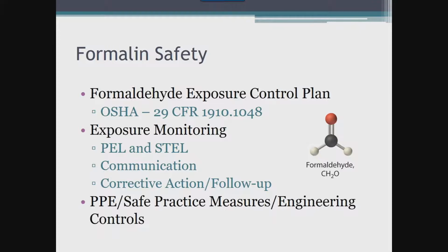Formaldehyde has very specific exposure limits. There is the permissible exposure limit and the short-term exposure limit. The permissible exposure limit, or the PEL, is the exposure limit that is allowed over time and generally calculated over an 8-hour period. It is based on a time-weighted average, or TWA.